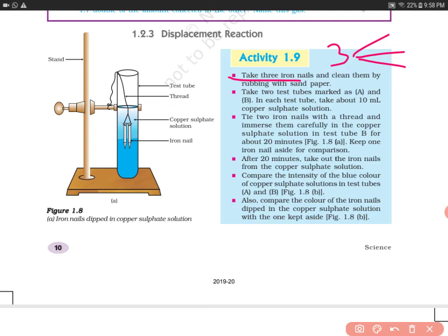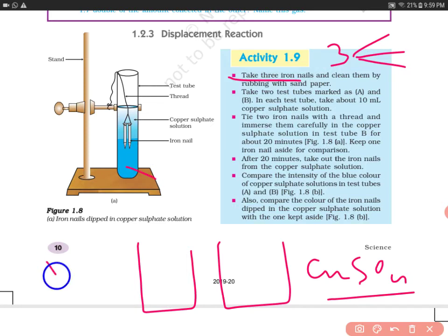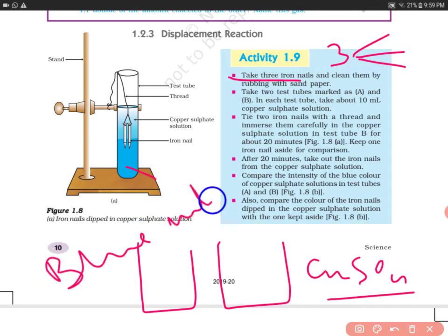Now take two test tubes marked as A and B, and in each test tube take about 10 ml of copper sulfate solution. Copper sulfate is blue in color. Another name of copper sulfate is blue vitriol, and it is also known as anti-fungal.